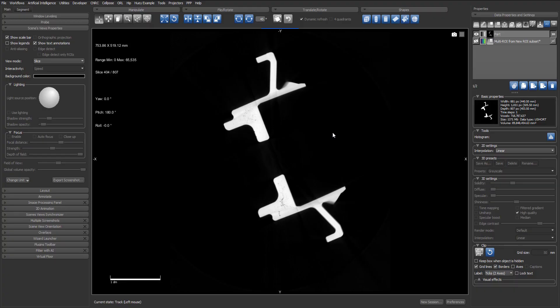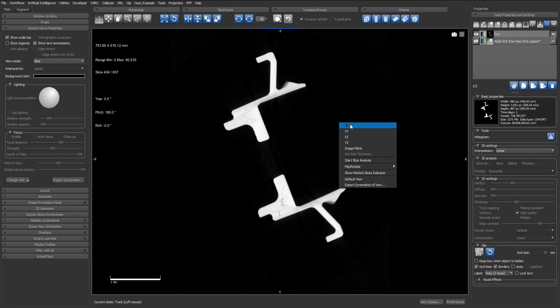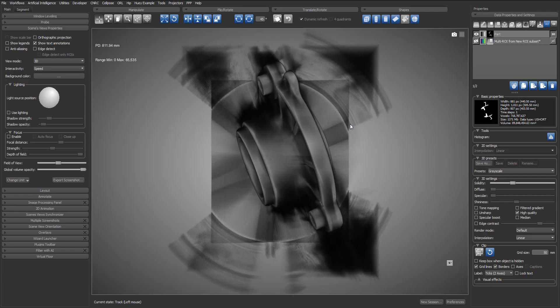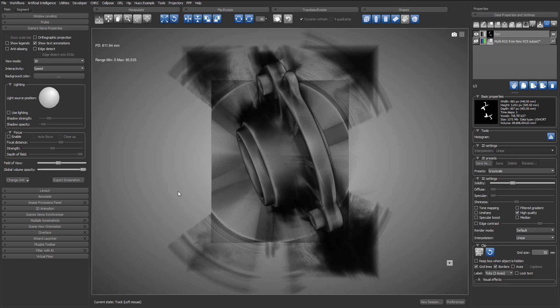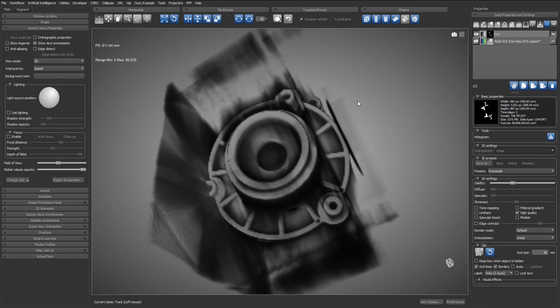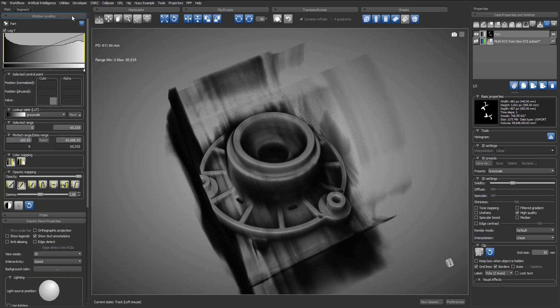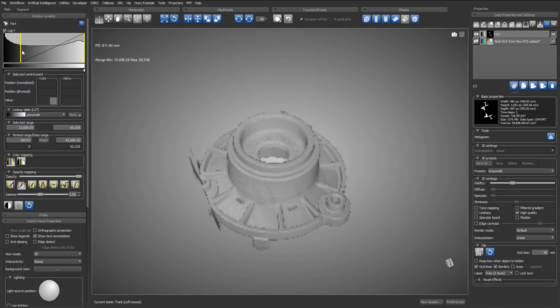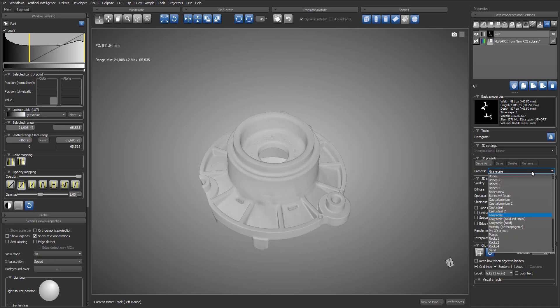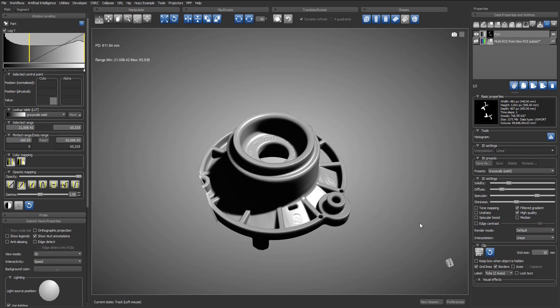Here we have an industrial part dataset in which the porosities have been segmented in the form of a multi-ROI. As you've seen before, the first thing we do is adjust the window leveling and we will apply the grayscale solid 3D preset. I will click on the eye in 3D icon to show the multi-ROI.